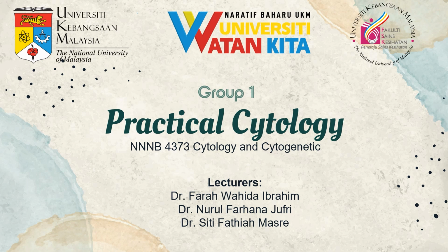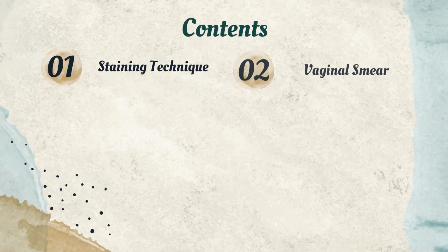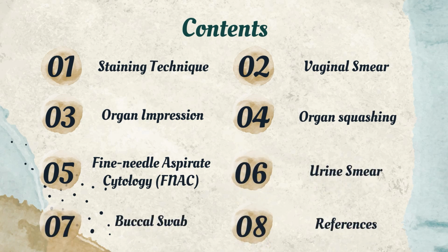In this video, we will be presenting our report on the cytology practical session. This is the list of names of our group members who have worked hard to prepare for this presentation. The contents of our presentation include the staining technique, vaginal smear, organ impression, organ squashing, fine needle aspirate cytology, FNAC, urine smear, buccal swab, and the references used.